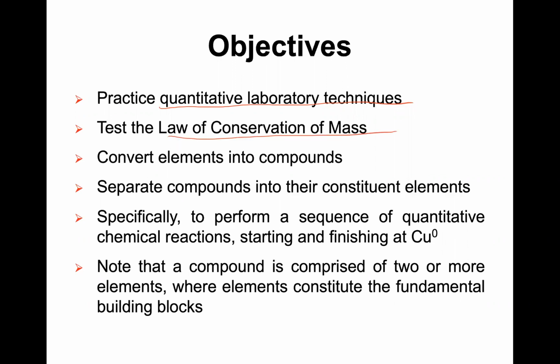Then we will convert elements into compounds. Basically, copper is a metal, not soluble in water, but we will try to convert it into a soluble form in aqueous solution. Then we will separate the compound into its constituent elements. Finally, we will convert those compounds involving copper back to copper again.